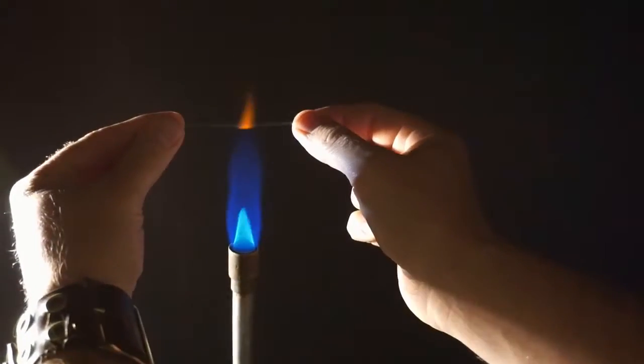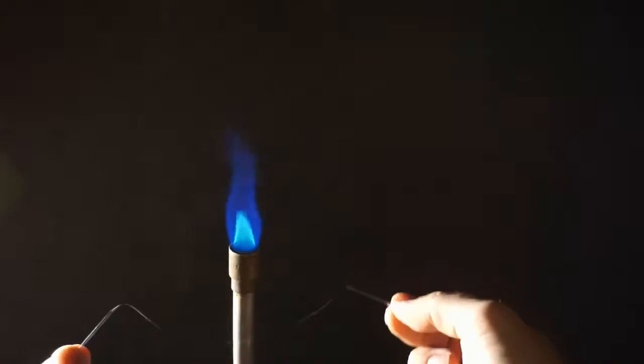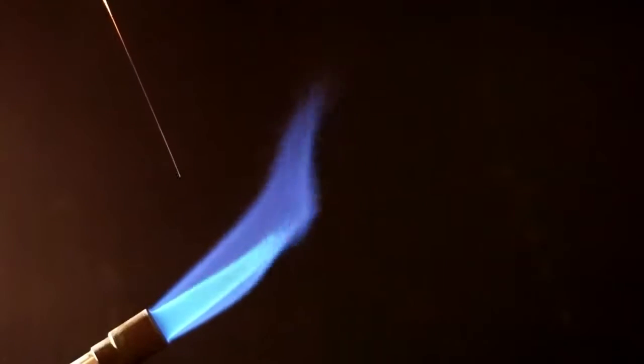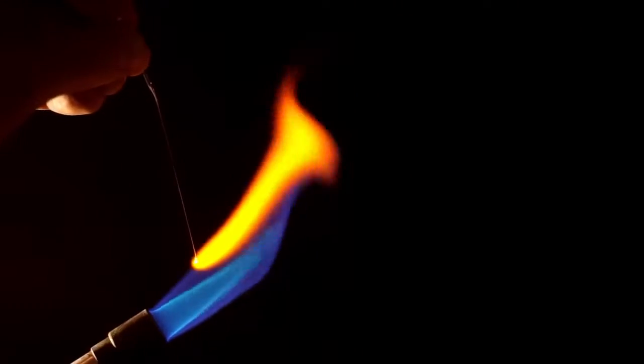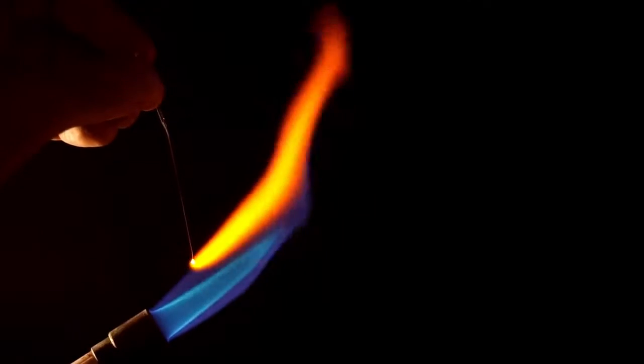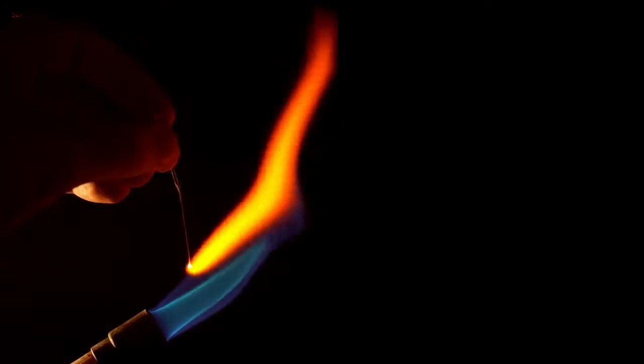Step one is melt a piece of glass in a flame. When it's soft, pull it out of the flame and stretch it really fast. Makes it very thin. Now break it and take the thin tip and insert it into the flame very slowly and evenly. If you do it very slowly, you'll form a perfect sphere of glass at the end of the thin piece.